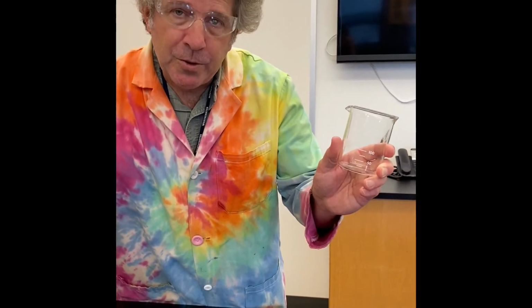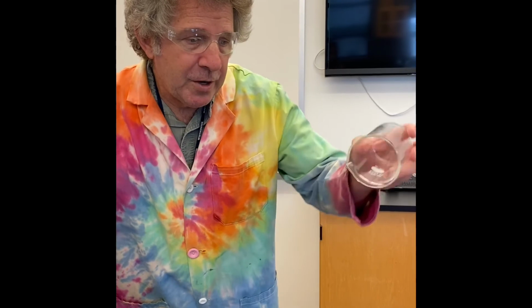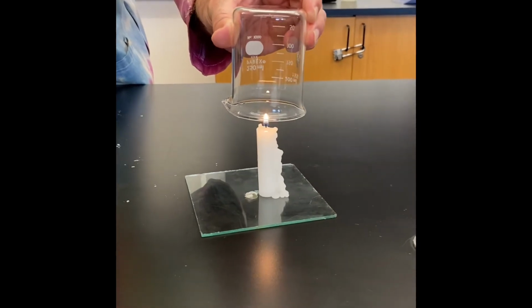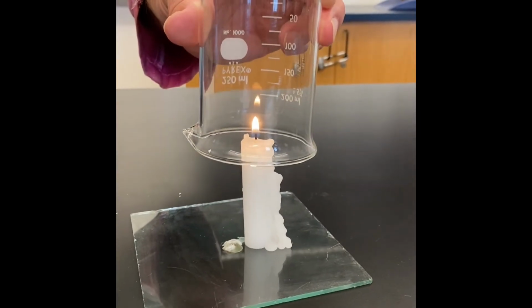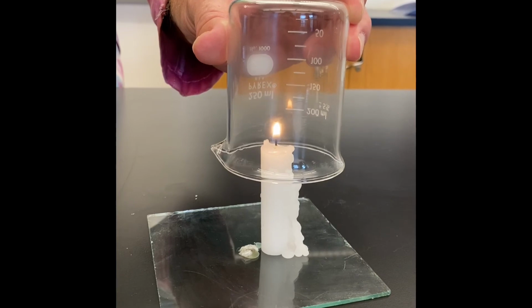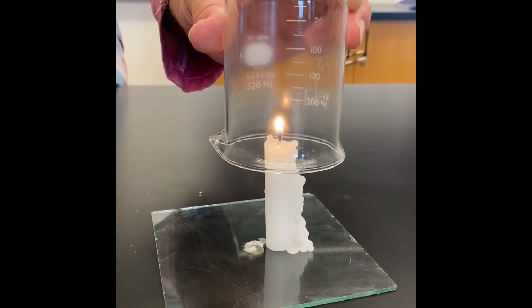Now I have a beaker, and we have our burning candle. I'm going to take the beaker and turn it upside down and hold it over top of the candle. While I do this, I don't want the candle to go out. I want it to continue to burn for probably at least maybe 15 to 20 seconds. And I'm looking for something to collect on the side of the beaker.